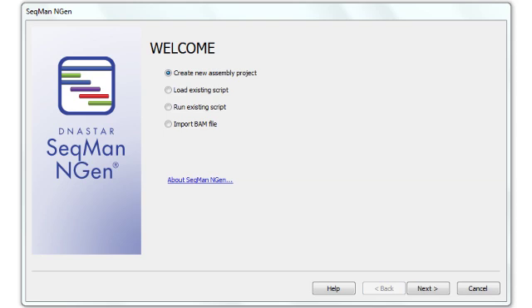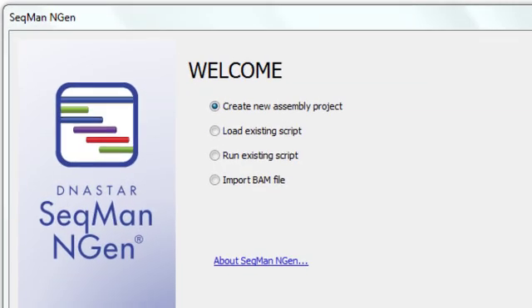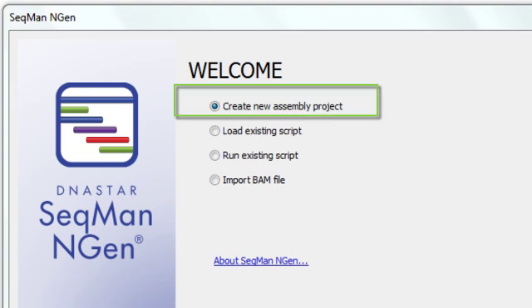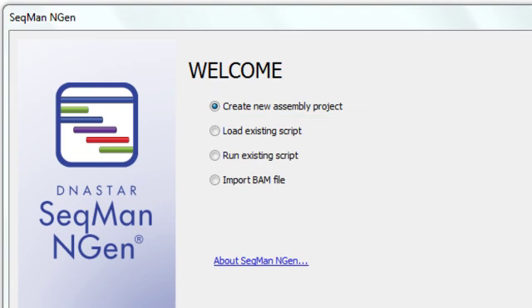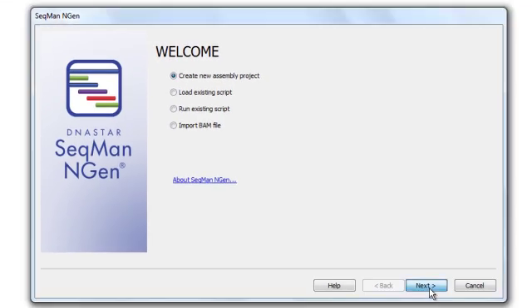These amplicons were generated using the Fluidigm EGFR gene panel and Fluidigm's access array, and then sequenced using the PacBio RS system. So to set up my assembly in SeqMan Engine, I select Create New Assembly Project, and then click Next.